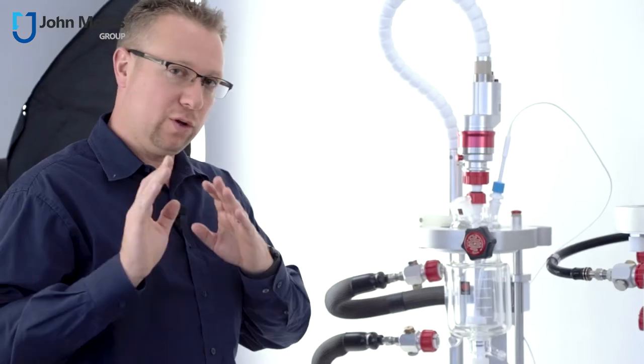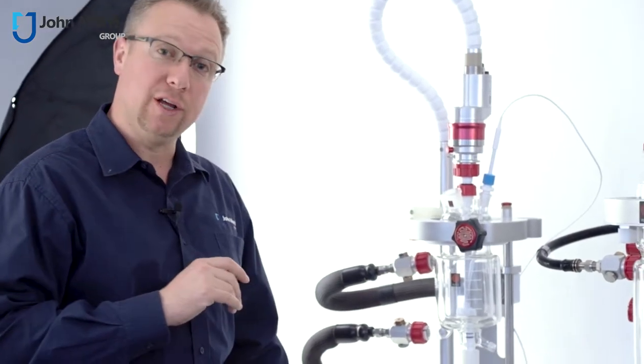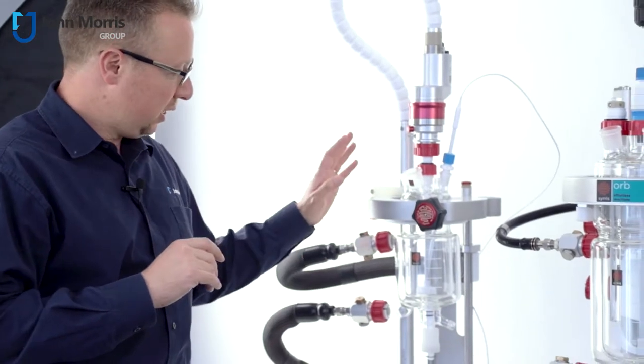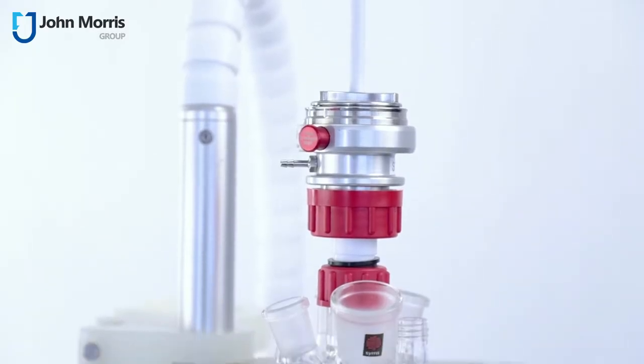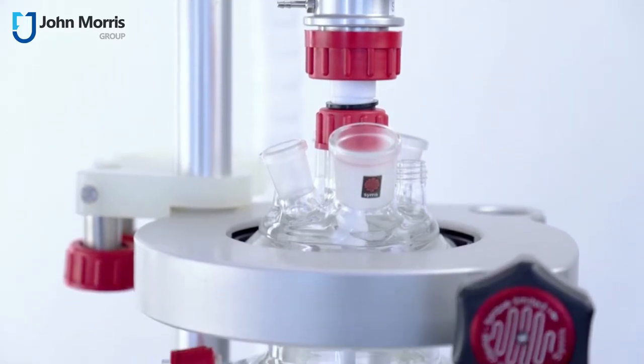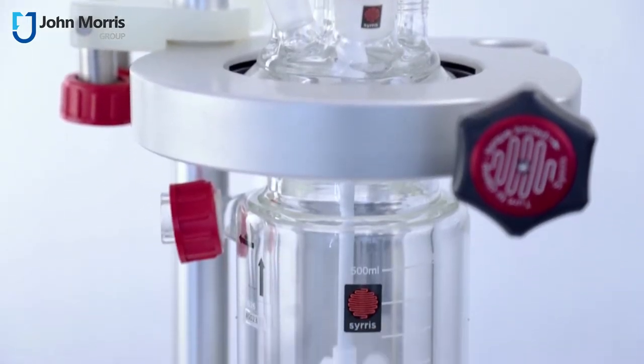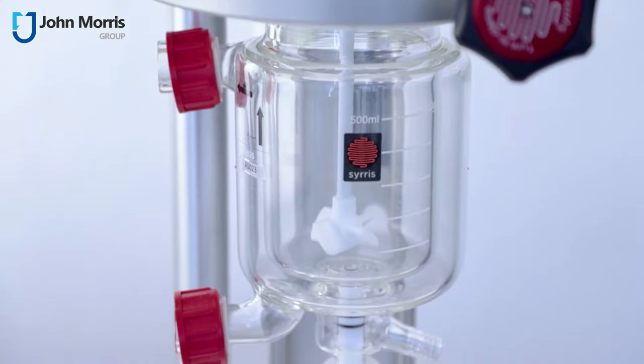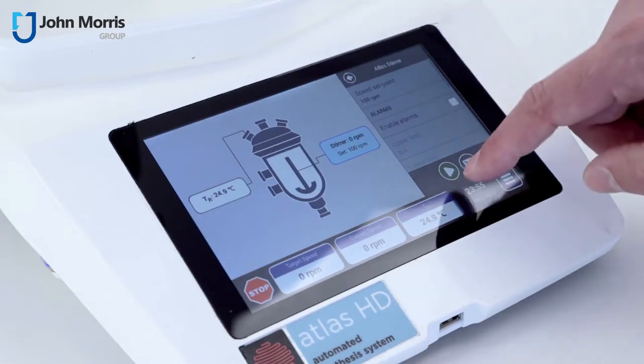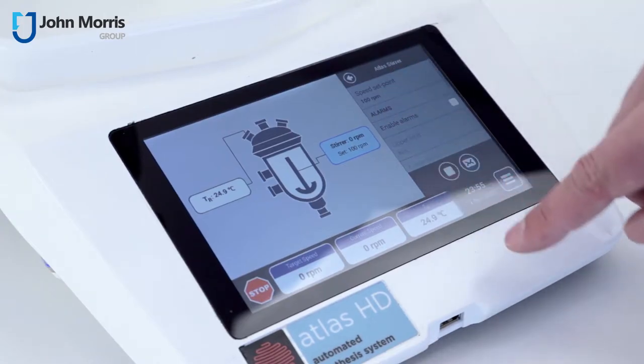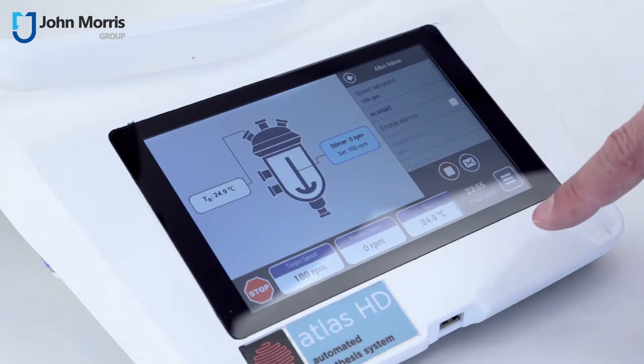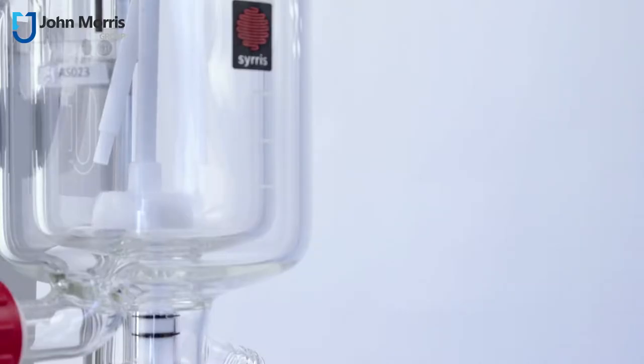In a previous video we talked about the fabulous Atlas HD from Cirrus. The Atlas HD is an amazing piece of kit because you can put in multiple different ranges of vessels, you can control a wide dynamic temperature range from far into the negative, far into the positive, you can control it here with this computer or plug it into external devices and it's great for a range of applications.